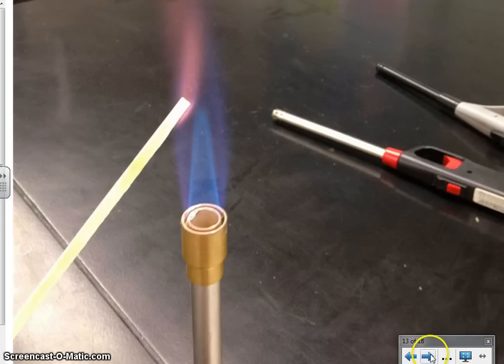You'll find that there's one of 2 unknowns. You either have unknown A or unknown B. This will be the 7th chemical that you'll burn, and that's what your job is, to identify that unknown based on the color that it burns compared to the other 6 that are known.